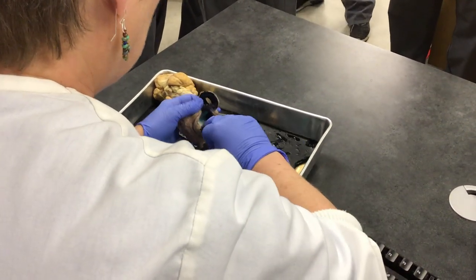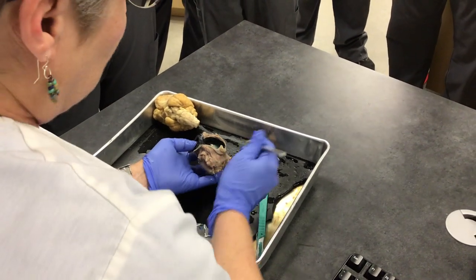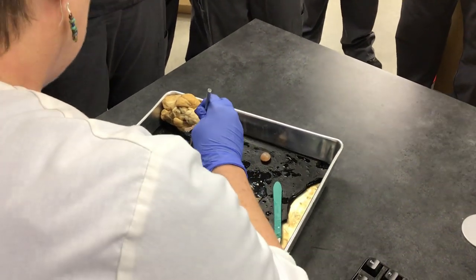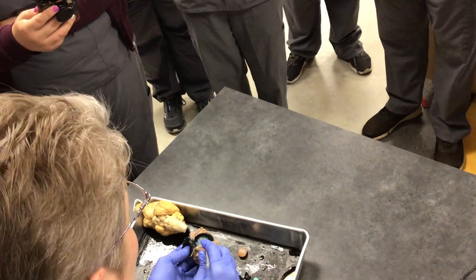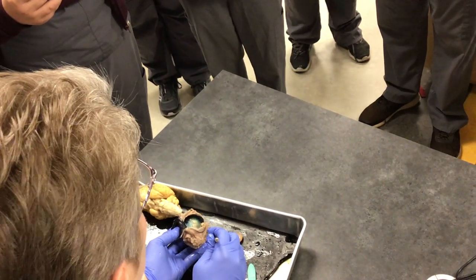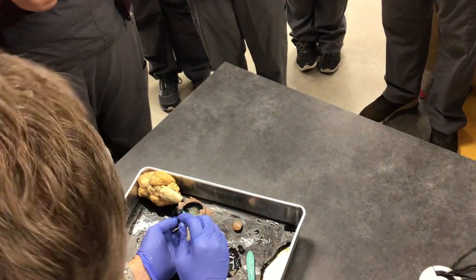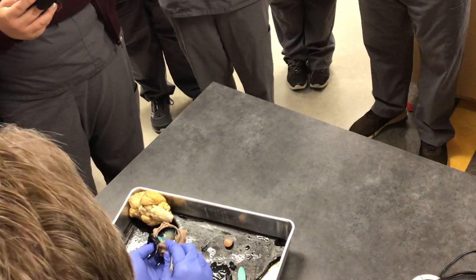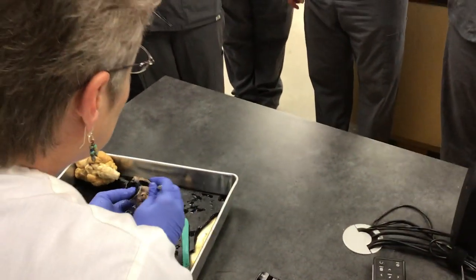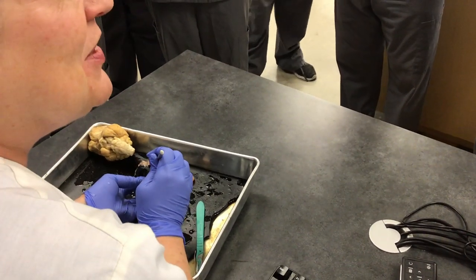Now I have one more thing to show you. You see this here? It kind of looks like the inside of a shell — you see the different colors, it's like blue. It's called tapetum lucidum, and it's for night vision. Dogs and cats have this too, so when you take a picture of your pet and the eyes glow, it's the tapetum lucidum.